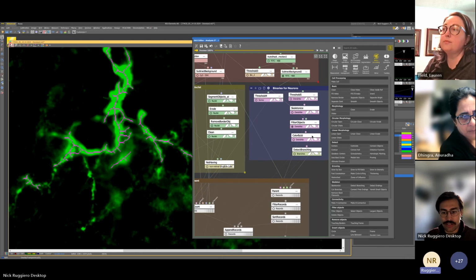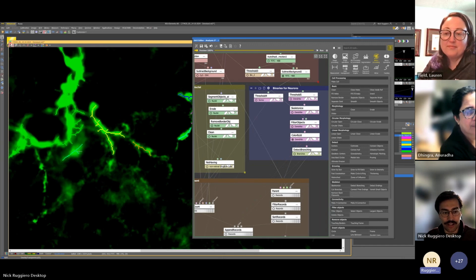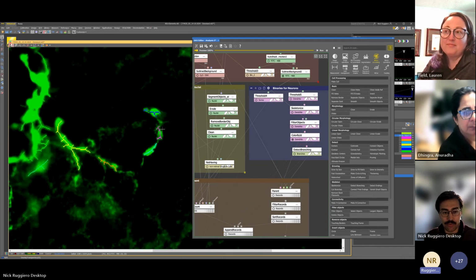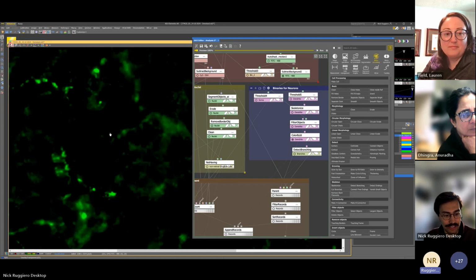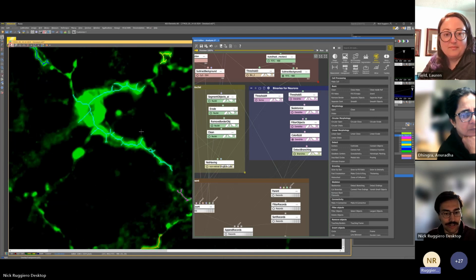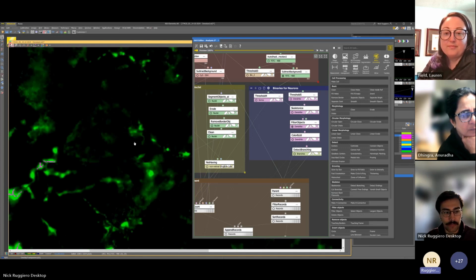The next one you'll see here is color by ID. I talk about this actually in the other analysis that I'm probably going to do. But this is another really popular function and one that I use a lot. It's not going to look perfect here. I just like to use it for checking. It will change every object to a different color. And that's really nice to see which objects are connected and which ones aren't. Obviously, this is a green. It changes this to green, which is really difficult to see. So I don't personally like it here. But over here, you can see that we have our different objects. So I'll keep this one on for now.